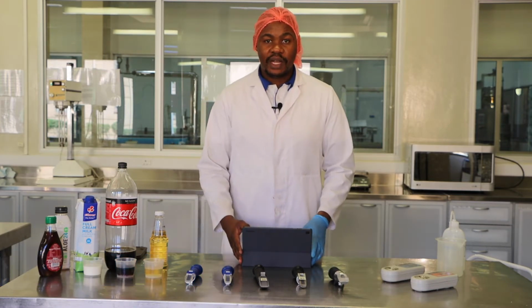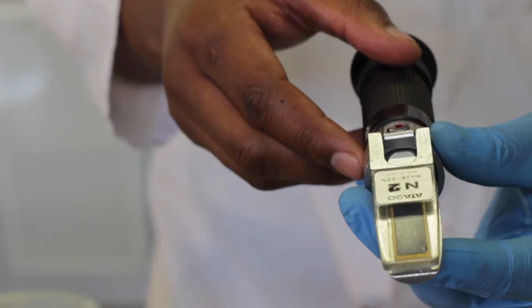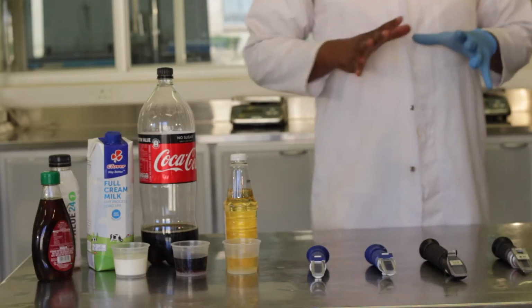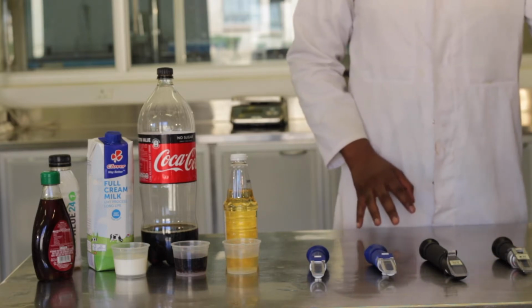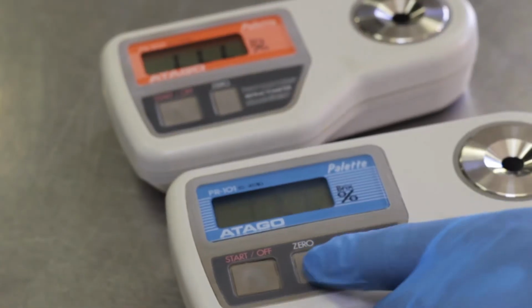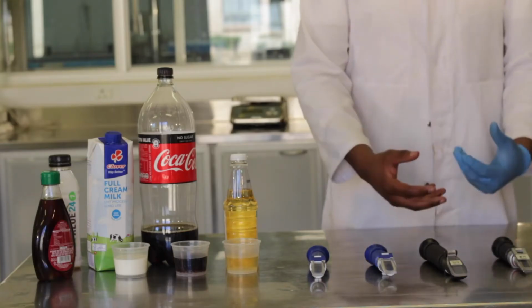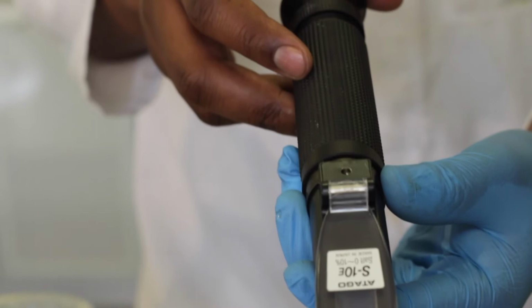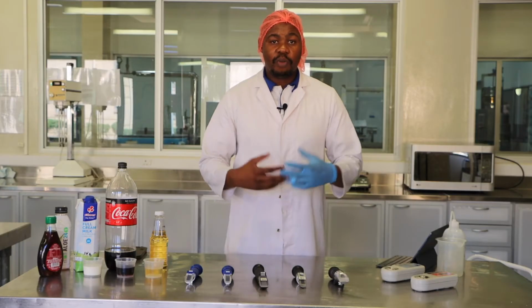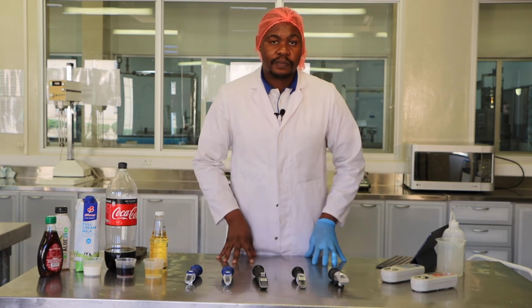Today we are going to be talking about a refractometer and how we can measure the sugar or, in some cases, salt concentrations using a refractometer. There are two types of refractometers that you can find. We have the digital refractometers, which give us a number or a value digitally, and we also have the handheld refractometers. The handheld refractometers also give us a number, but we have to read carefully through our eyes.